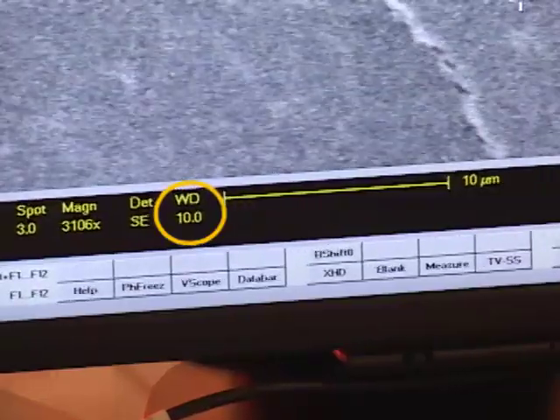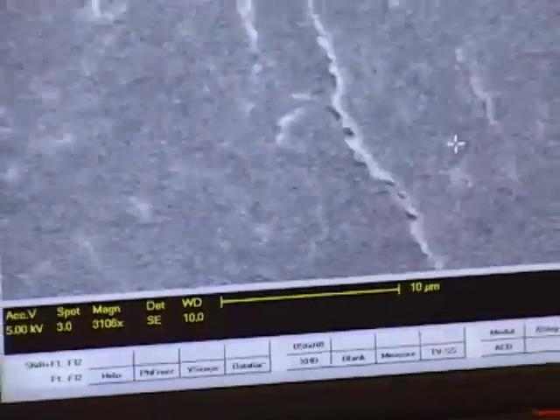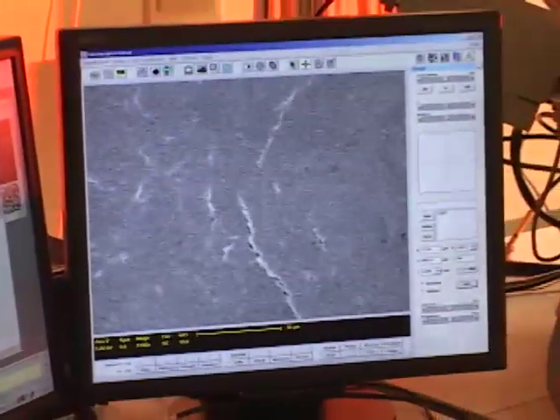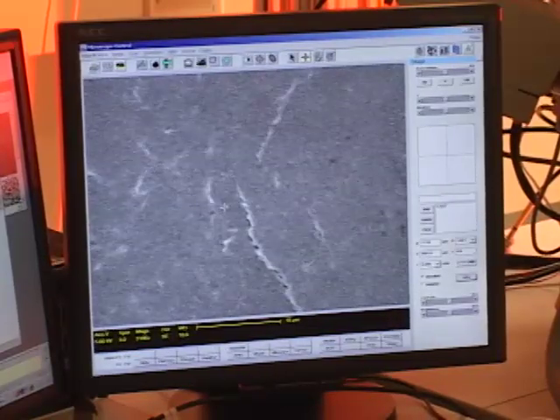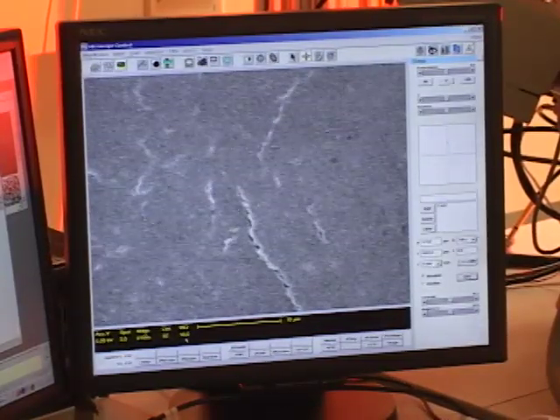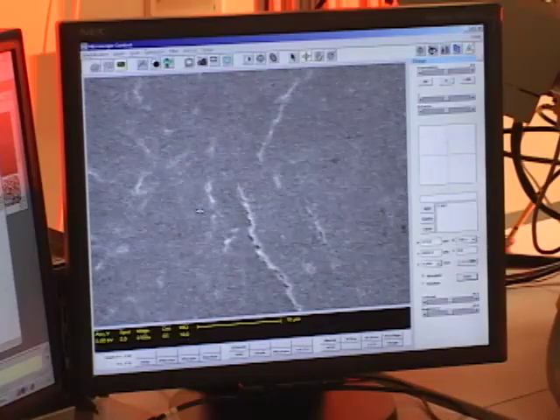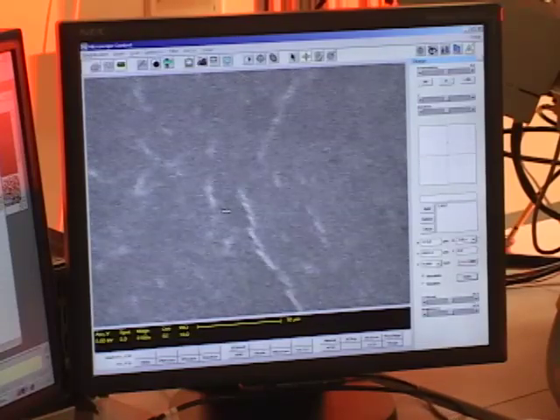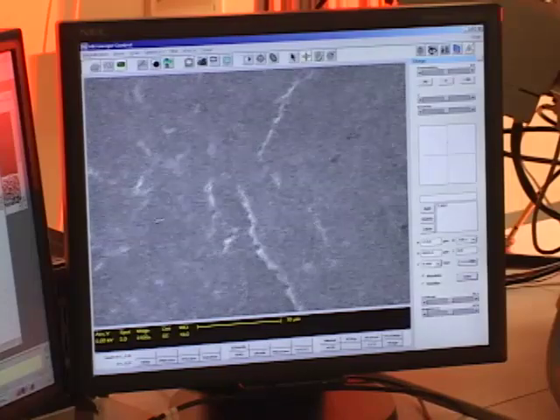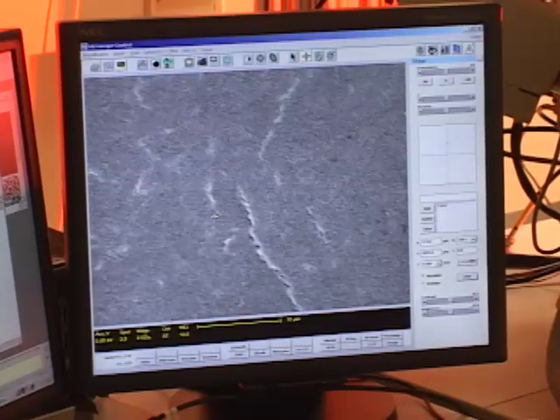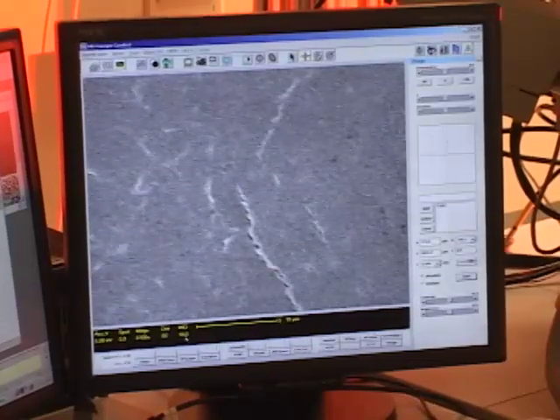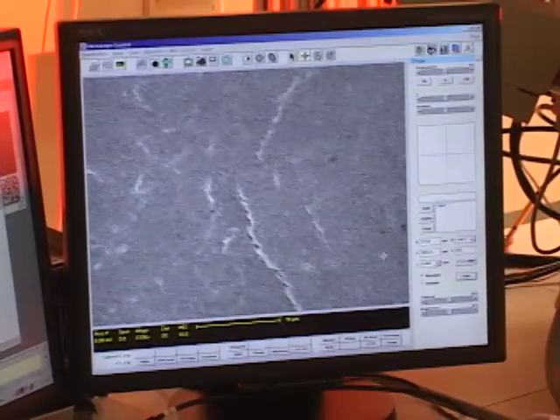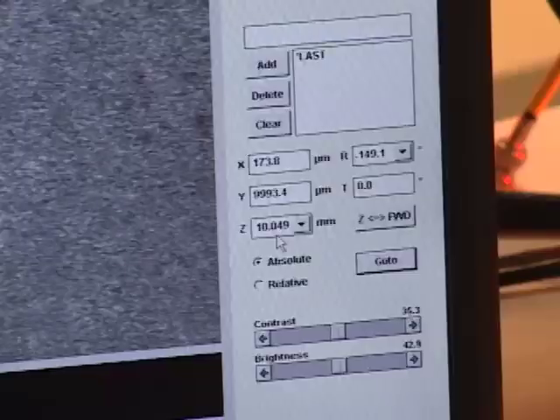So my working distance now is 10 millimeters. And the resolution of the stage motor is on the order of micron, so it doesn't go to exactly the position that I want it to go to. And after I've told it to move to 10 millimeters, I need to refocus and actually tell how high it went because it will be slightly off from 10. I'm going to focus again to get the best possible focus. I can see that I'm off by less than a tenth of a millimeter in this case. But I want to recalibrate the height of the stage.